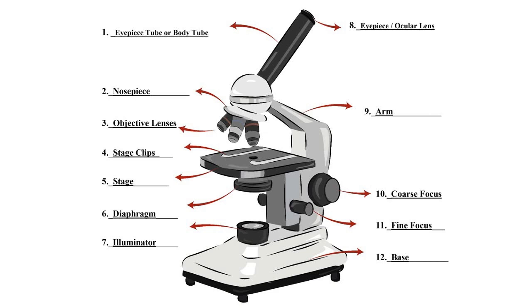Here are the coarse and fine focus knobs. The coarse focus knob is good for getting an initial view, and the fine focus knob moves the stage in smaller gradations for precise focusing. The illuminator is a light source located beneath the stage that provides illumination for the specimen. And then there is the base. These are the main parts of the compound microscope — depending on its type and complexity, there can be additional features.